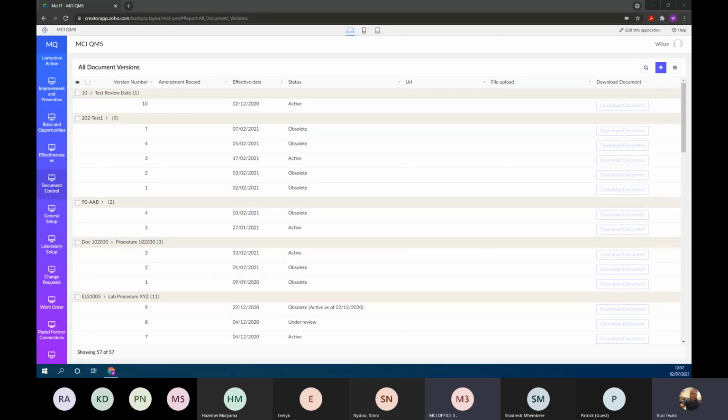I can register a building or a fume cabinet as well, and schedule weekly checks, to make sure vents are open and chemicals aren't expired and so forth. And that's the facility, the environment. So that's how we cover, even though we don't call it health and safety, you achieve health and safety through effectively using all these modules with the appropriate understanding.